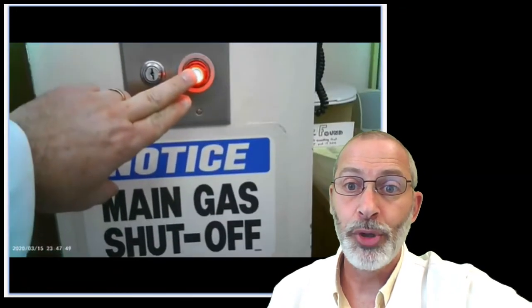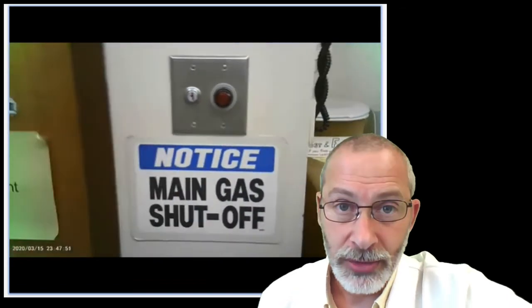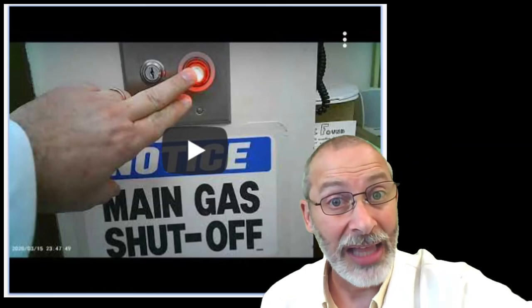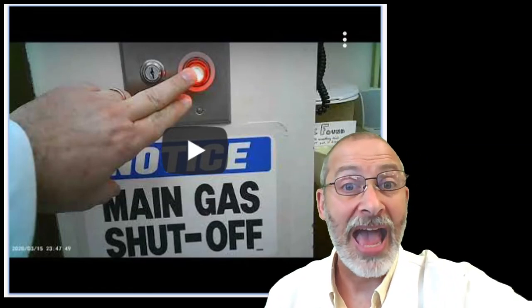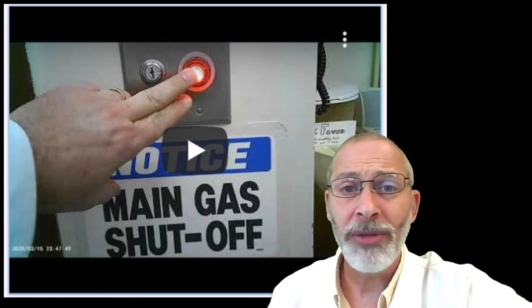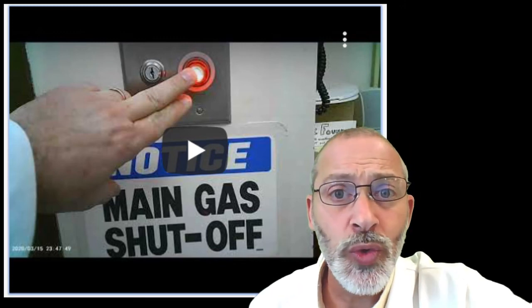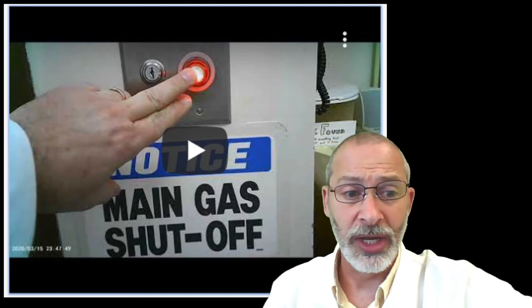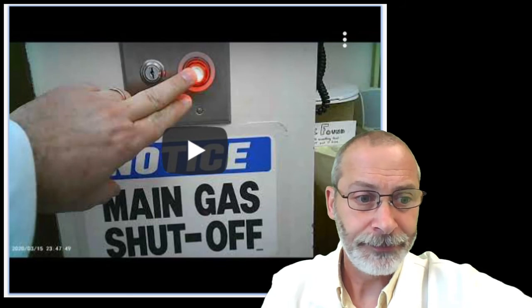Notice pushing the button shuts the light off, and you'll hear a loud click. That loud click that you will hear in the laboratory is the gas being shut off to the entire lab. But always remember there's residual gas in the lines, as we will discover when we start using the Bunsen burners.